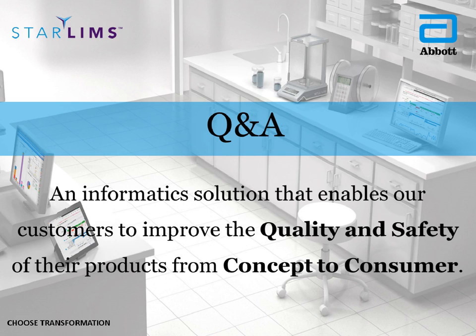Yeah, great question. So in our system, when it comes to aliquoting, we always have to provide two options, manual and automated. In the case of aliquoting for Hamilton, it is quite similar to the manual. Why do I say that? Because Hamilton allows you to send all of the information, so the LIMS needs to calculate and check all the different parent samples that are going to be used for aliquoting, provide that information to the Hamilton of the parent samples and the positions in the containers, and give the information of the expected aliquots, the specific positions that they need to go in the destination containers for those aliquots, the volumes of the aliquots and all that.